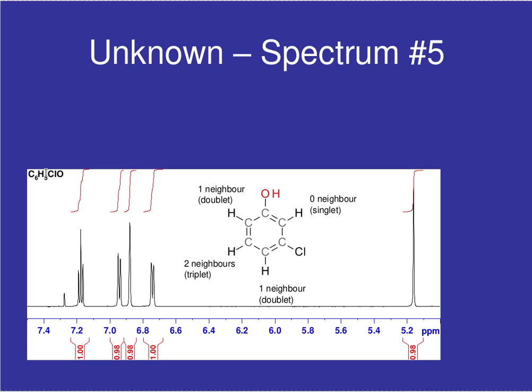The compound has to be metachlorophenol that we see over there. So the splitting has very clearly defined what the compound is, and we're fully able to define it. And just to mention that OH must appear as this signal that's over here.